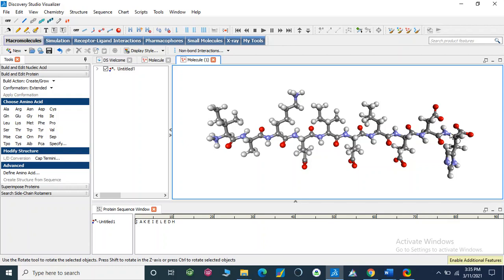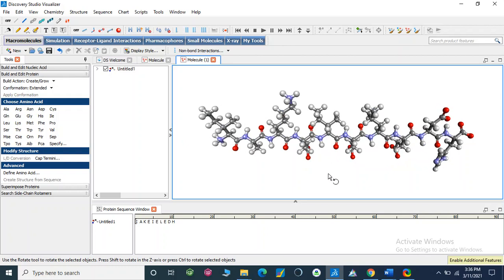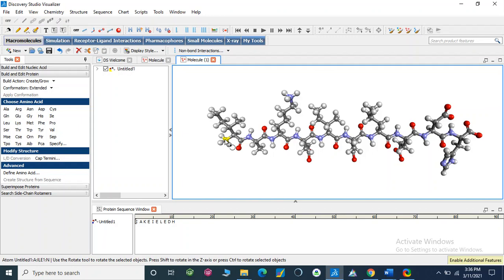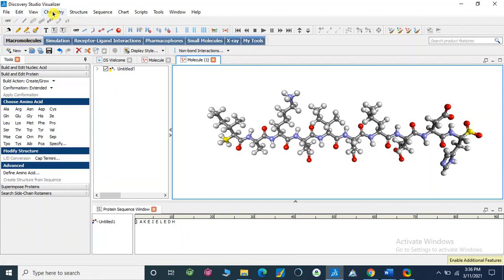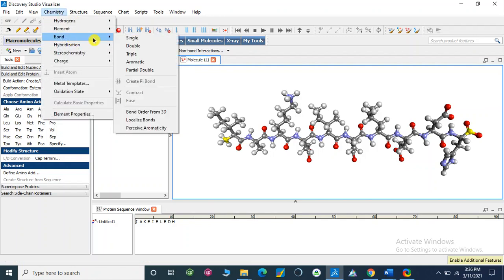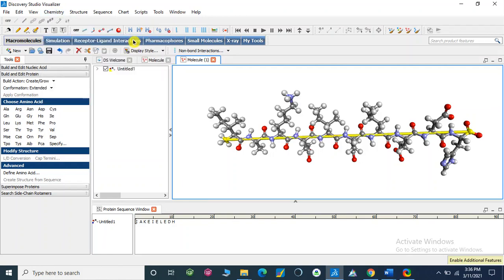We can make a bond here by selecting this one and this one. Go to Chemistry, Bond. Make a single bond. Bond is formed. Now we can remove this oxygen, we don't need it because it is removed.